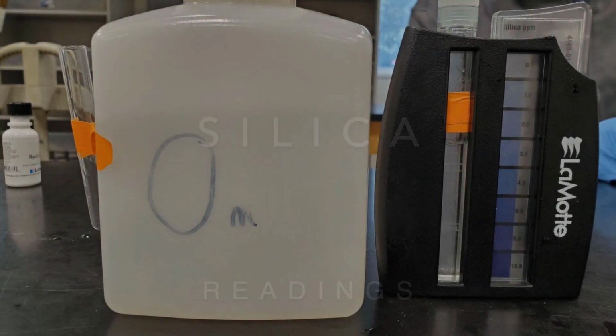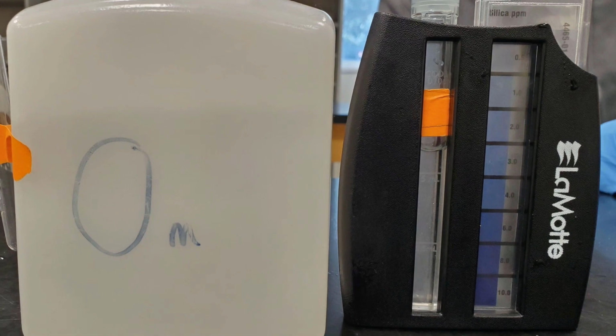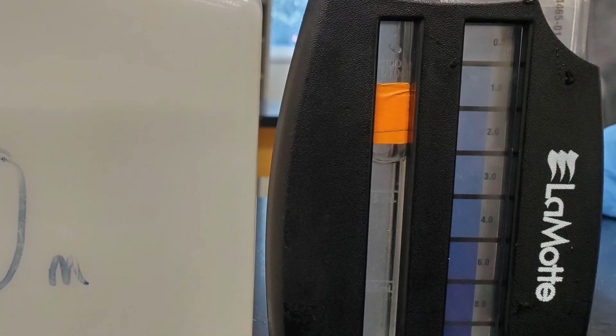The readings of this one are the same as for nitrogen. Just find the closest color on the right and write down that number for your measurement. The units for this are once again in ppm.